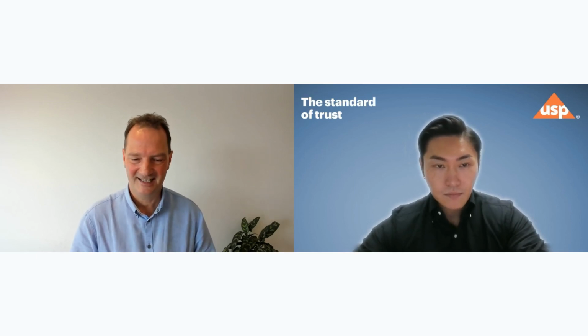The topic of today is the new USP chapter 1132.1, using mass spectrometry for host cell protein analysis, and the standards to be provided by the USP to support these analysis. This is a very exciting topic for many people. We have more than 400 sign-ups for this webinar today. So we think, Derek, that this is going to change the industry as we think about it today.